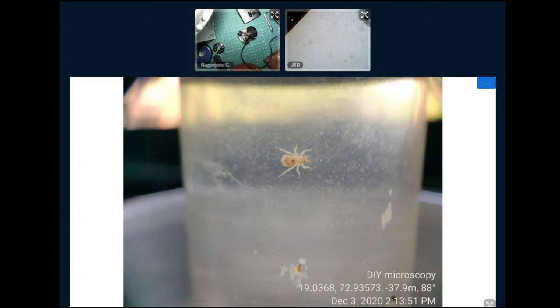But whether it will deteriorate the transparency or not, I have no idea. I think it shouldn't, because the watchmakers who polish your dial don't leave any scratches, so it becomes very clean. So I'm assuming that it should work and give you a good lens. So that teardrop portion can get eroded away.